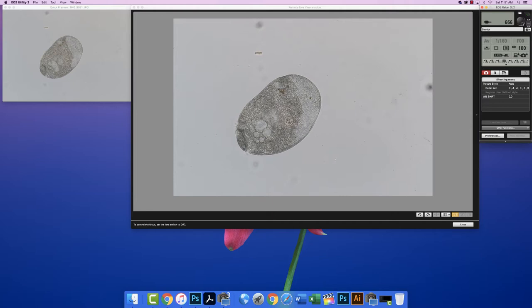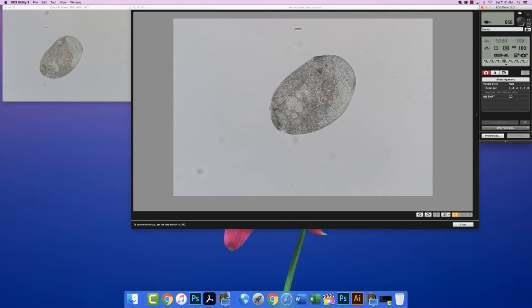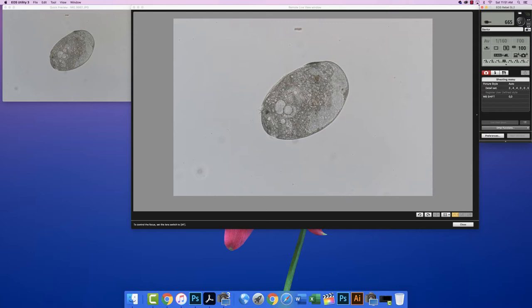I'll try to center this guy again, and try to refocus. That looks good. So both at the 5x objective and at the 10x objective, the whole organism looks to be in focus. That's because there's a relatively large depth of field for 5 and 10.